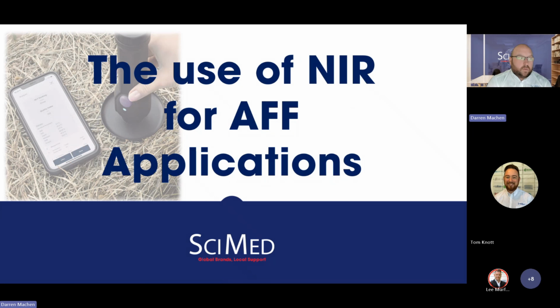So, the uses of NIR for agri-food and feed. NIR in this industry is quite mature. There are a lot of customers, a lot of companies out there using benchtops. So I've done this a bit more from a handheld point of view, because like anything, things are getting miniaturized, the performance is improving, and there's a keen need to do literally in-field analysis, or at least at-line as well.